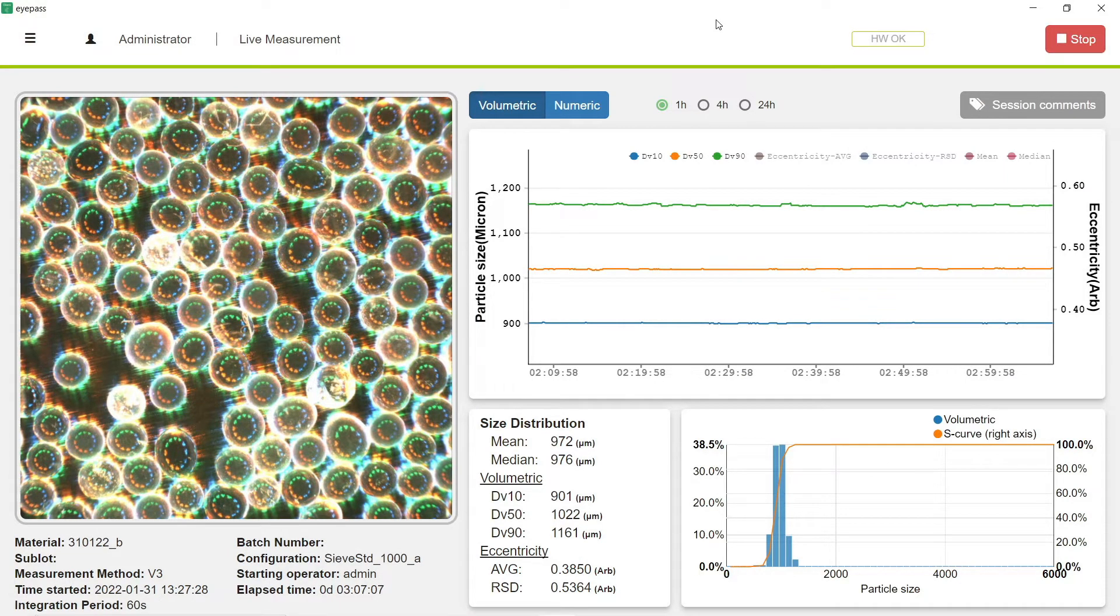This is actually glass beads used for sieve standards. These are certified 1000 micron glass beads that are used throughout industry to verify that your sieves are operating correctly. We use these on purpose here to train our image analysis software for what is 1000 microns, and we can see the results we're getting back in real time non-product contact fashion.